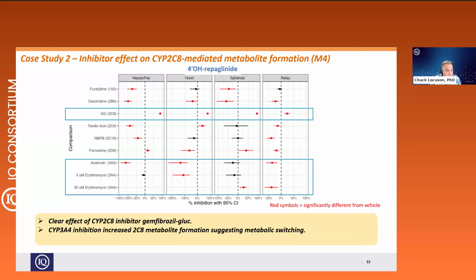Next slide. For repaglinide, there was a similar study conducted in HepatoPac, and our results agree with that earlier study on the contribution of CYP3A4. If you compare these, the bolded FM values.